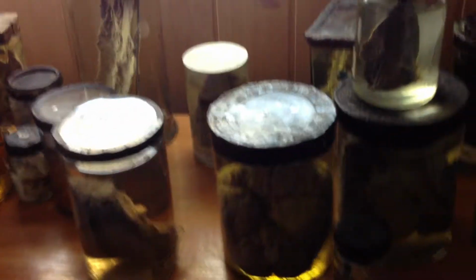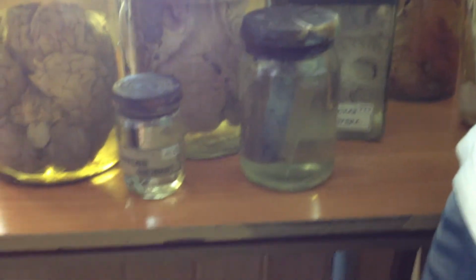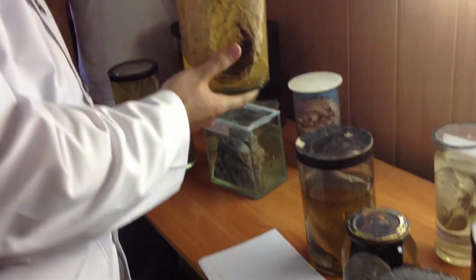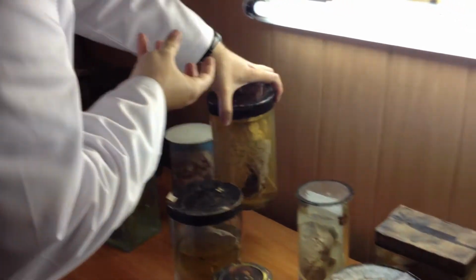What is this, teacher? Part of lung. Hemorrhagic infarction of the lung. Leaks, so be careful. Brain hemorrhage. Maybe there would be... It's not actually a cyst yet. This is hematoma. The hematoma, yeah. Cyst would be the outcome.